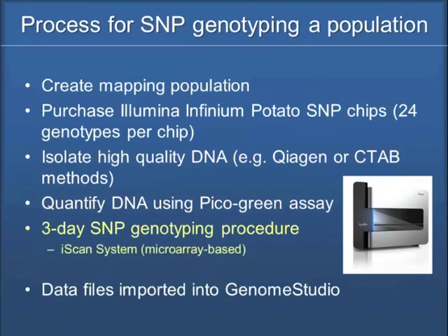And so it's truly a 3-day procedure. Everybody always likes to make something seem a little better than it really is, and so I would always tell people, oh, it's about a week.